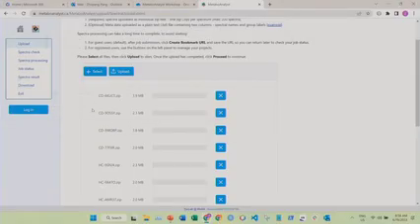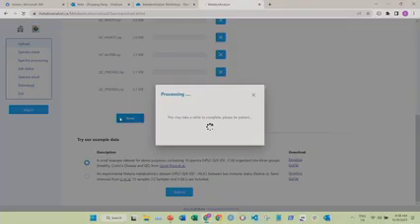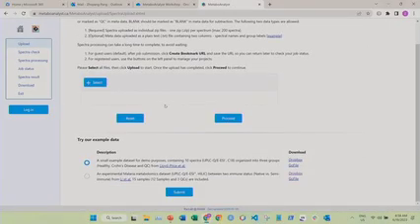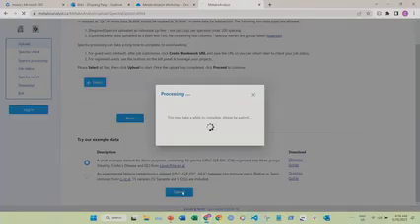But here I don't want to go through the data uploading because it's going to be slow, since we have around 80% here. So I want to use our example data directly. The data has been loaded on our server, so we just need to click submit directly. As you can see, the data is being uploaded and loaded by our server. It will take a few seconds.